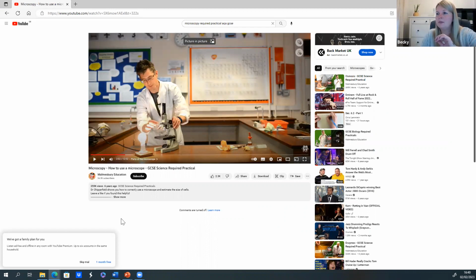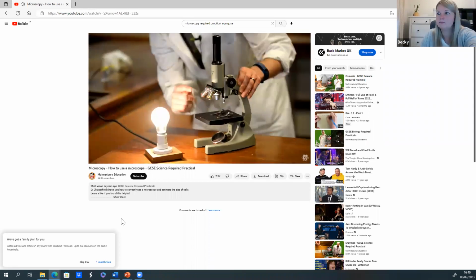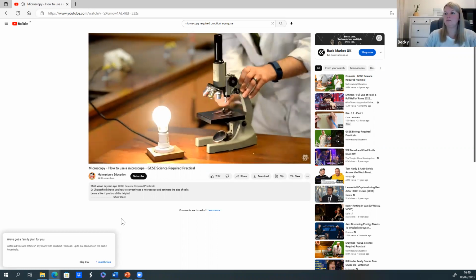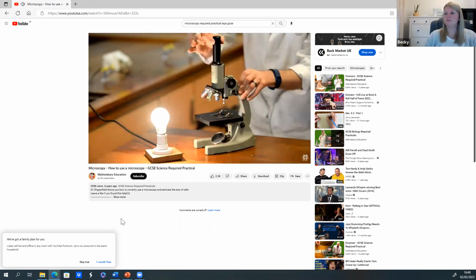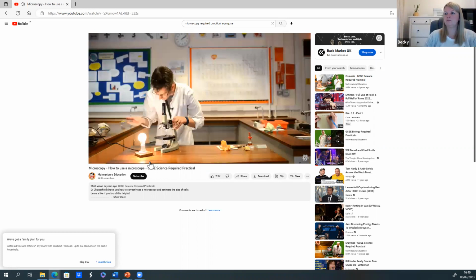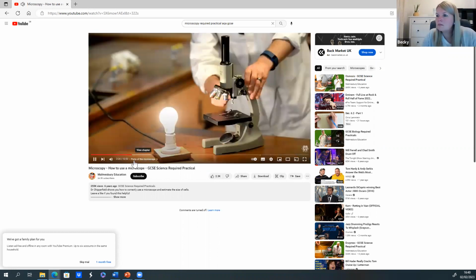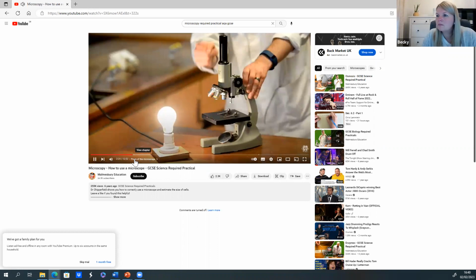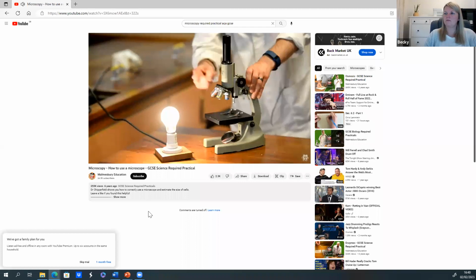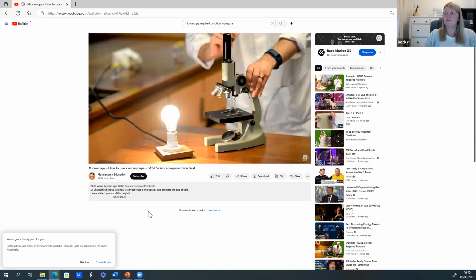Objective lenses, we have 3 here. We've got a ×4 lens, a ×10 lens, and a ×40 lens. The light coming up from the mirror up to our specimen here goes up into this lens, up through here to the eyepiece lens. This is another 10 times magnification lens, and then we can see our sample when it's on the microscope. What this means is ×4 ×10 gives us 40 times magnification. That's our lowest magnification, all the way up to ×40 ×10 gives a magnification of 400 times. So this is our microscope.